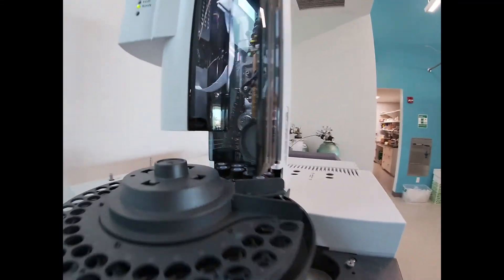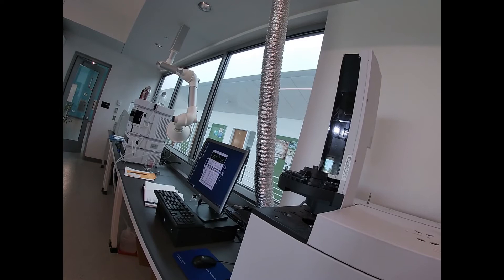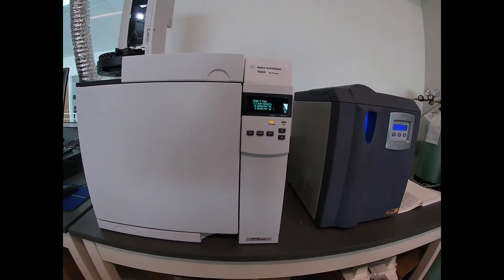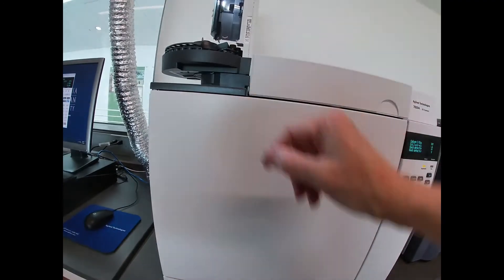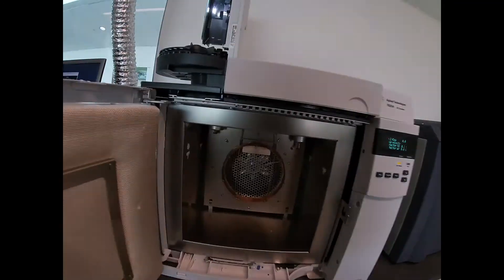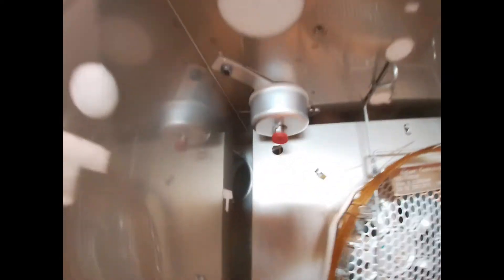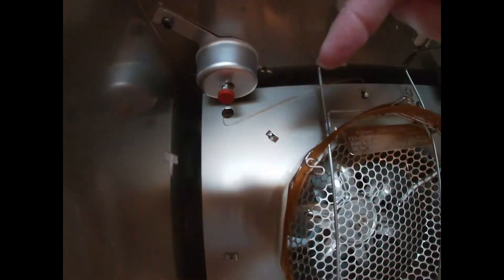Our hydrogen generator hasn't been run for a while so it needs to get back into whack. So again, our sample comes down from our injector, it's mixed with our hydrogen gas, and then it flows through here under our capillary column.